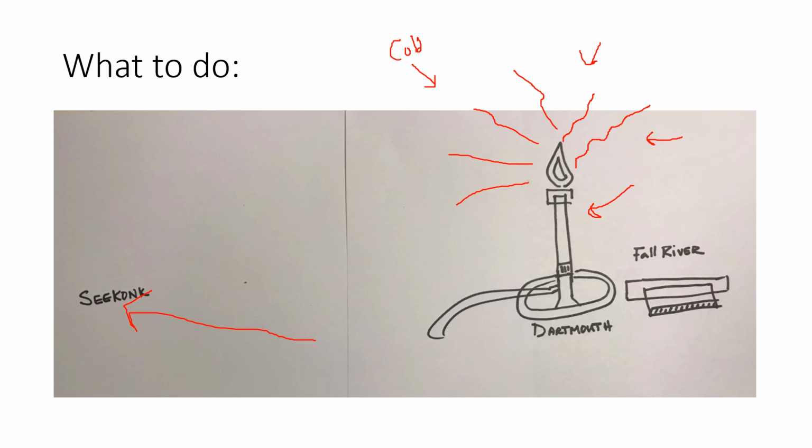After we've streaked the plate and we put it in the incubator, we always want to put our plates in the incubator upside down so that any condensation that might form in the plate forms on the lid and not on the agar where our bacteria are. That also can lead to contamination.